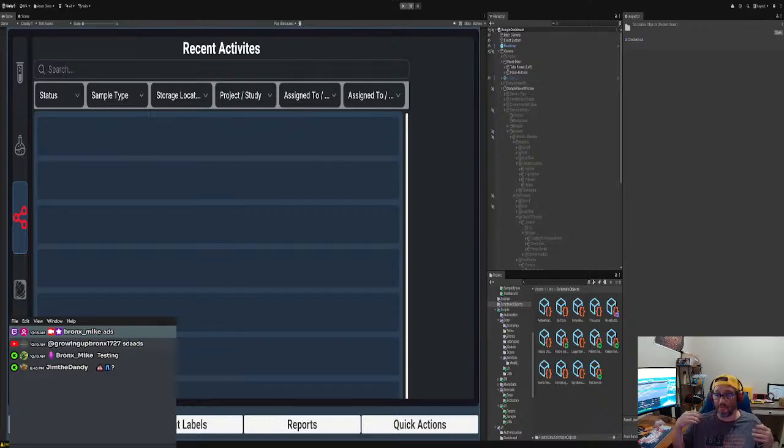This is what I'm saying. If you have to write methods that make sense, so it's quick and easy, but also have one method that's more abstract that will allow you to get stuff by sample ID, by the patient ID, by this ID. But it's good to just separate them and make them into different methods, right? That's how we make it concrete, right? Like here, right? This is the query.